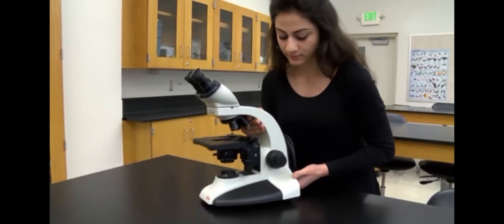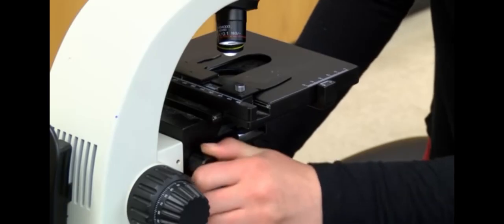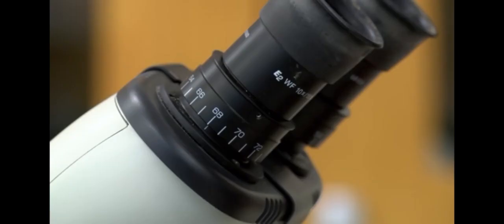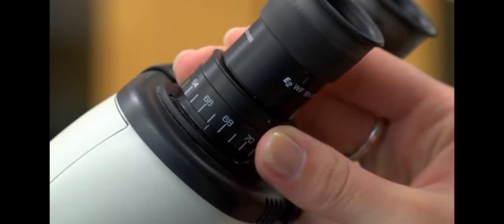These are the steps in using a microscope. First, plug in and turn on the base illuminator. Second, raise the nosepiece using the coarse adjustment knob. This provides greater access to the stage when the slide is in position.